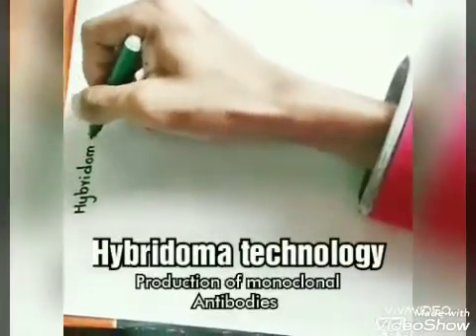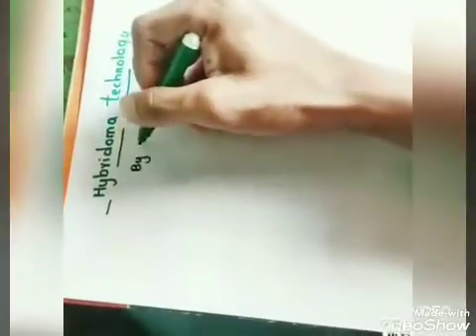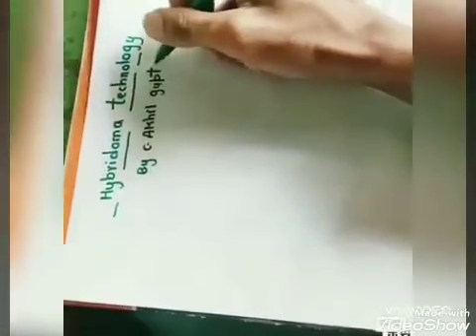Hello guys, today we are going to discuss Hybridoma technology. Hybridoma technology is majorly used to create antibodies against a single specific antigen. Let us discuss this with some basics.